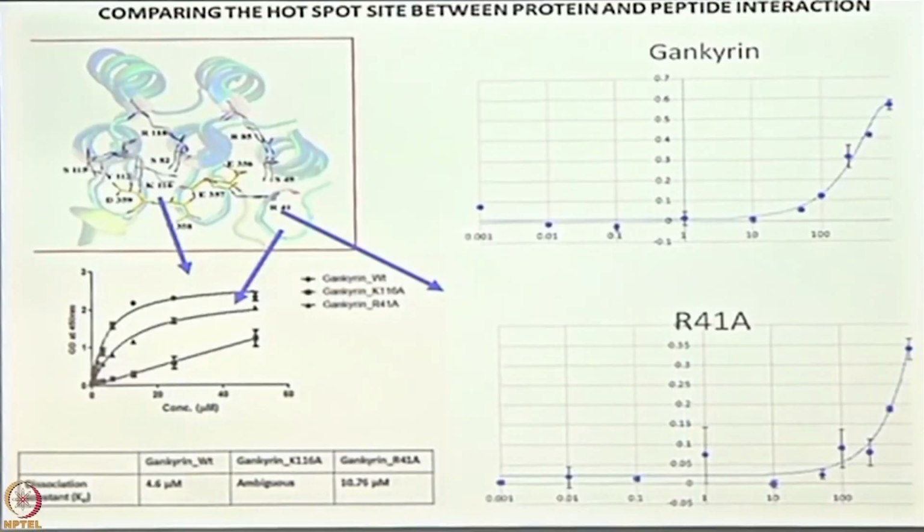We went back to our old technique of ELISA, where you can look at peptide-protein interaction, only that the peptide is now labeled with a biotin, so that you can pick it up with a streptavidin alkaline phosphatase. You can see this is the wild-type peptide interaction. It hasn't gone to the saturation. This is still in process. We probably have to get a new peptide preparation. This is hot from the oven.